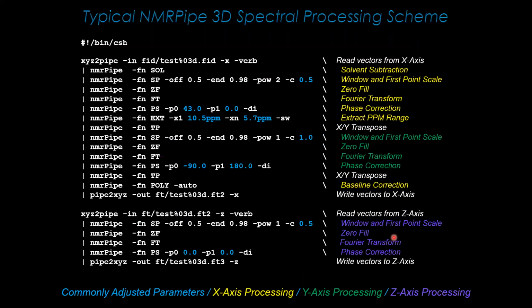Now, what you see here is an annotated and typical Unix shell script for processing 3D data. And what you see is a pipeline of commands.